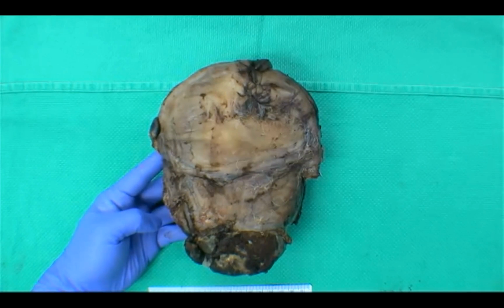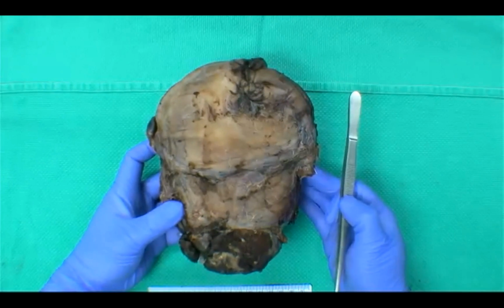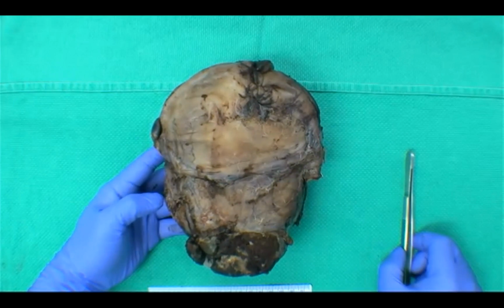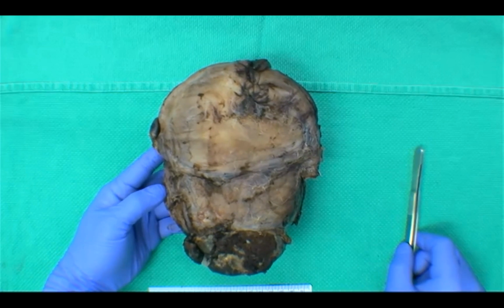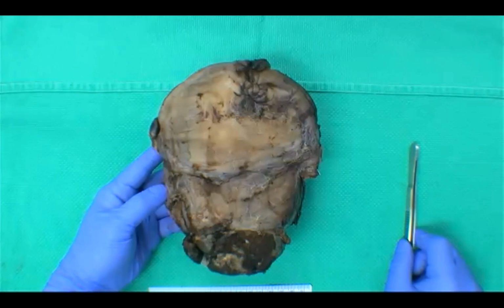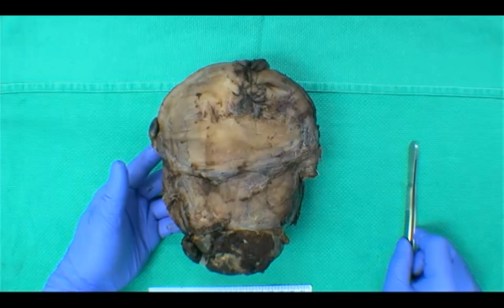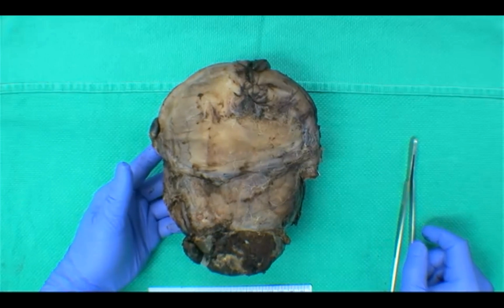Thank you, everyone. So I think this is probably a good time to get into talking about how to approach and gross this kind of specimen. Sometimes these specimens can be a bit daunting due to their fairly large size, but really the approach for grossing these postpartum hysterectomies, especially when you have a placenta that's in situ, is you're just combining a basic gross protocol for a total hysterectomy and a gross approach of the placenta, and then you're just kind of combining the two.